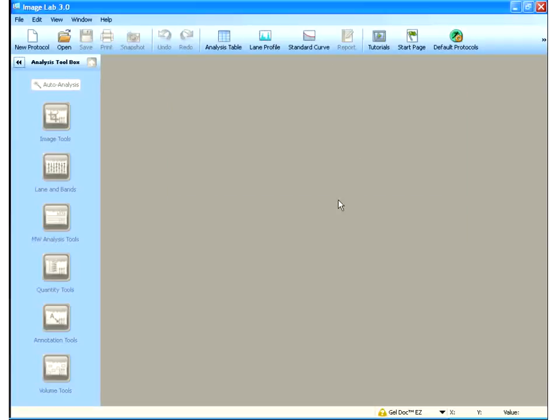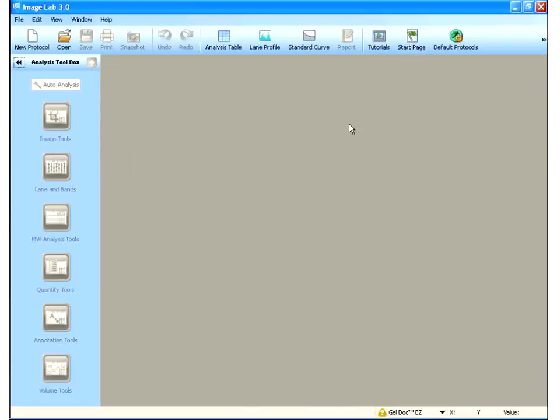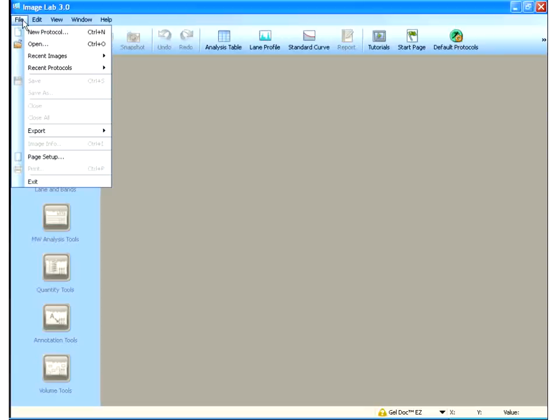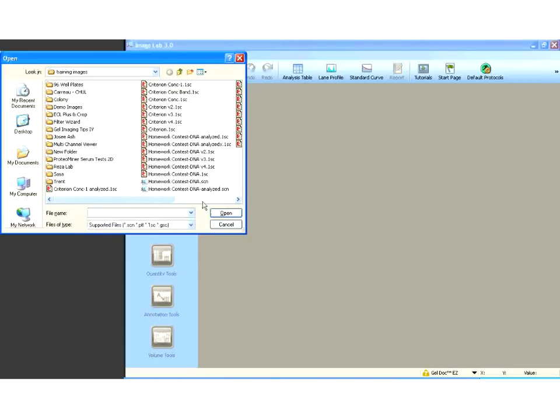I just clicked off the startup guide, which is here, the start page, which is the way the software actually opens. So I clicked off this, and now I'm going to open an image file. File, open, and you can open an image file.